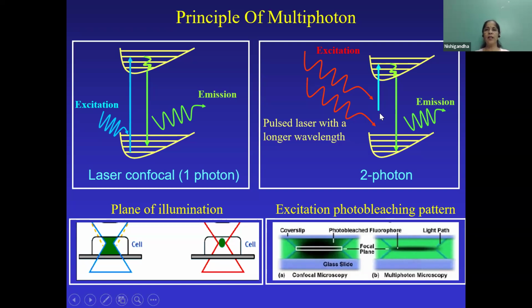So when they collide, what you get is a higher energy, that is blue light. This blue light excites fluorochrome and green energy is emitted. Now, the collision point cannot be like a whole block. So it's a particular point. It's a very well controlled reaction. So what happens, say for example, this is a point of collision. So only in this point, there will be a blue light. The rest of the sample is saved from exposure to the excitation wavelength.